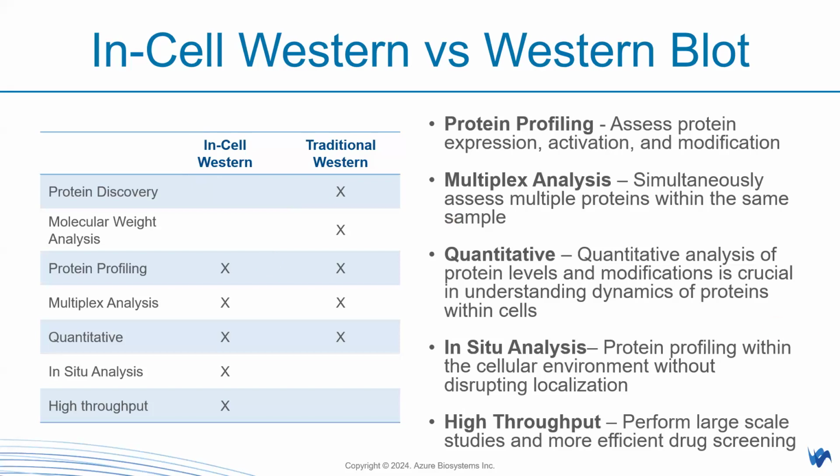Okay, so for example, protein phosphorylation levels, like kinase signaling, like MAP kinase cascades. So this is a mass screening of a certain thing, in a large quantity. Or they can study the abundance of cell surface proteins, ligand binding, surface receptors, internalization. Those are more for cell signaling.